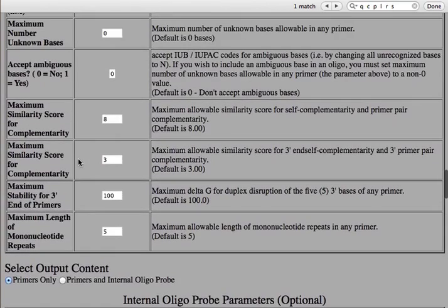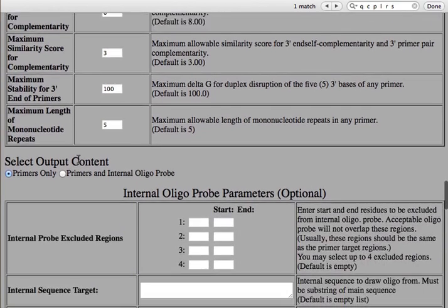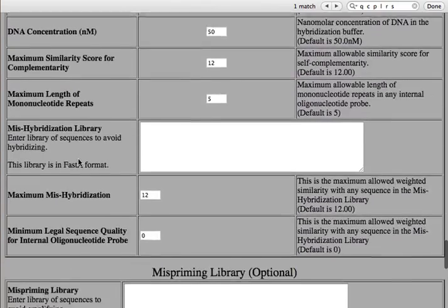Also, remember you have 2 primers, one that's going to bind to the 5' end of the DNA, and the other that's going to bind towards the 3' end. You don't want your 2 primers to bind to each other. So what if one primer had a bunch of C's and the other primer had a bunch of G's? Then they might bind to each other before binding to the DNA. So there's a lot of little things to look for, and that's what this software is doing for us to make the primers that are the best.